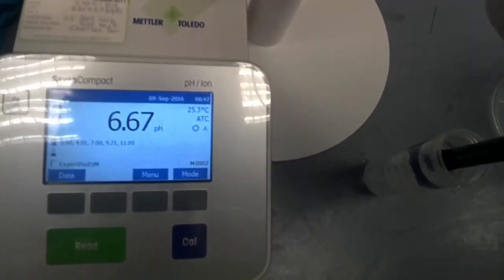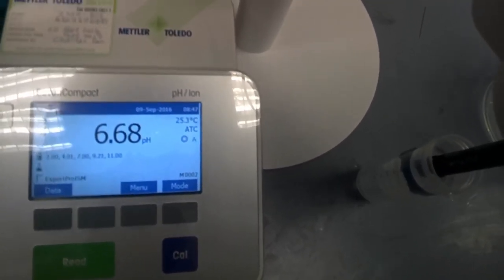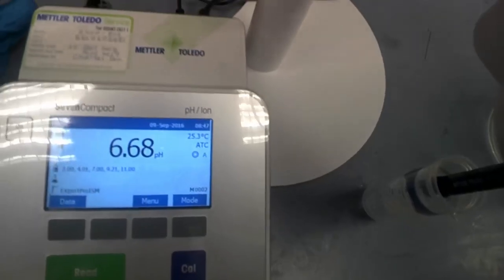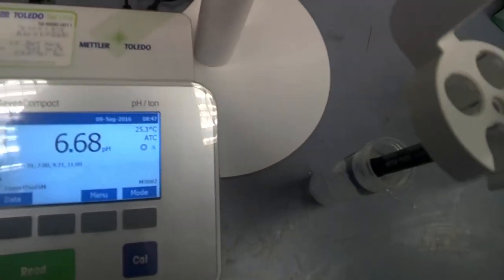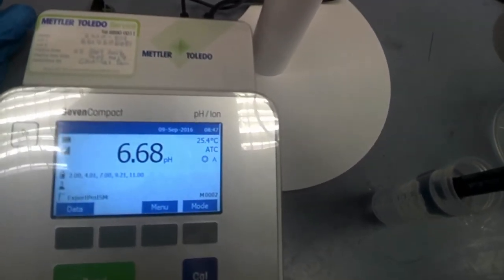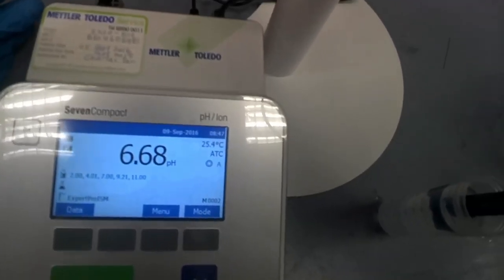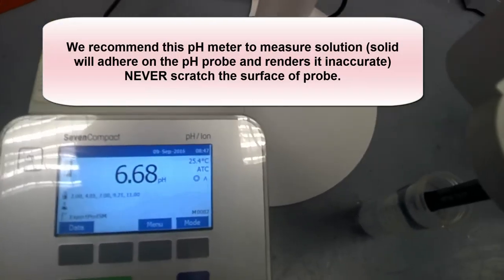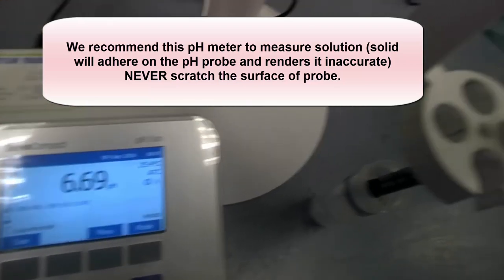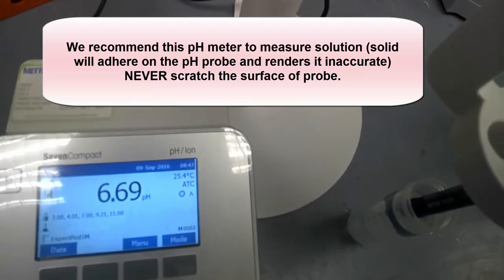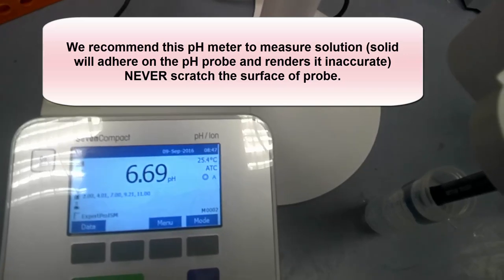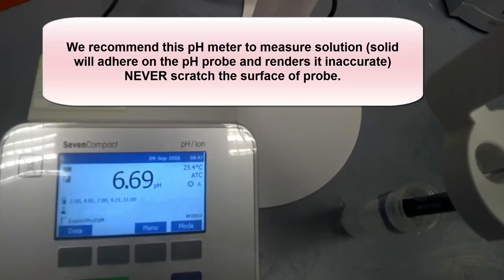This pH meter, try to use it for homogeneous solution. If you have some solid, it is recommended not to use it. Because you have some solid that stains on the exterior surface of the pH probe that can affect the reading. But let's say, unfortunately, you have noticed there's some solid on the surface of this pH probe. Please inform the engineer to record down in the logbook so that we know what to follow up for.